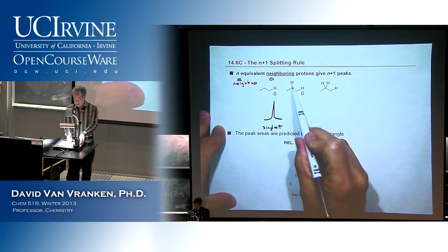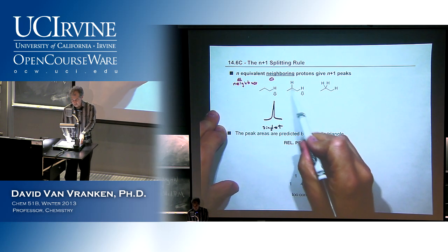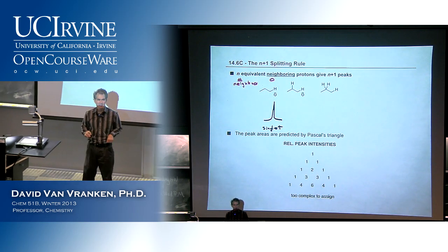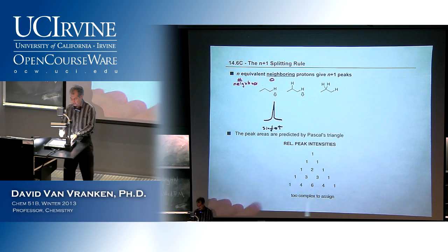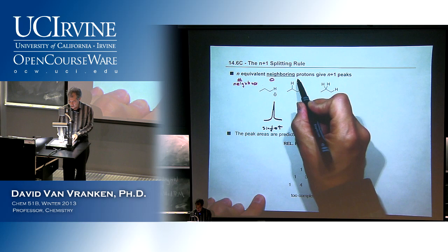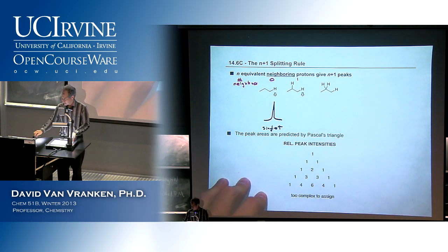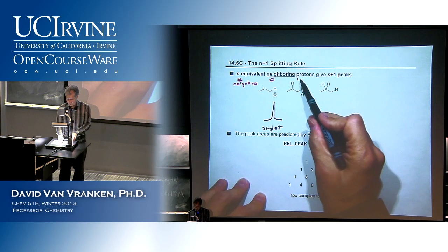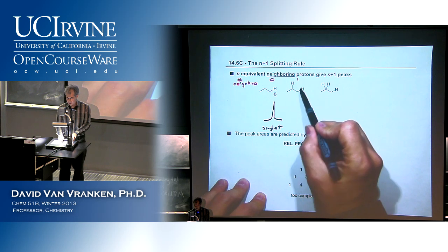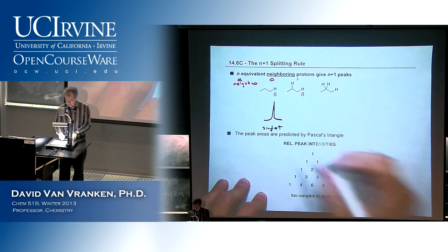But now let's take a look at an alternative scenario where there's a single neighboring proton. Who cares what the other groups are, chlorines, bromines, maybe it's part of a double bond, carbon atoms. I'm not going to draw any of the other neighboring atoms. We don't care about those. I'm simply telling you that in this scenario, there's one neighboring proton that's either two, three, or four bonds away, like this. The N plus one rule says one plus one: if there's one neighbor, then I ought to see this proton appear as a doublet, two peaks.